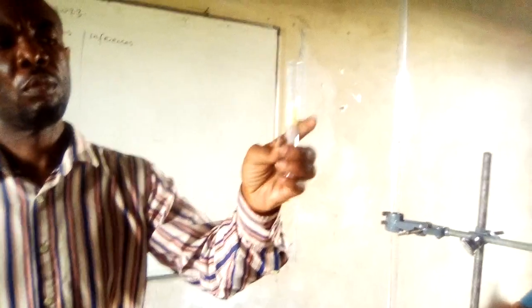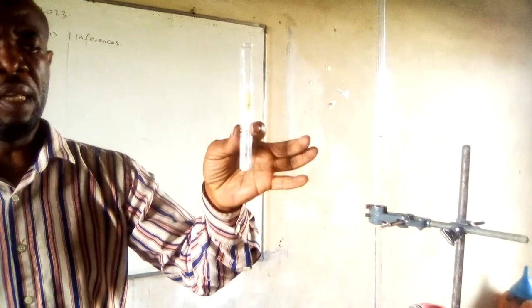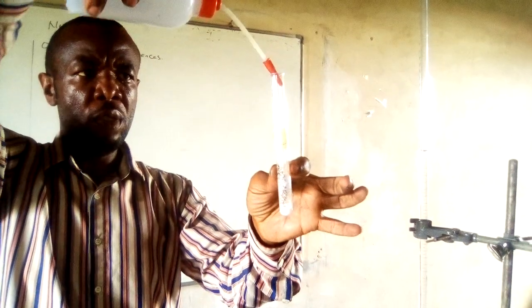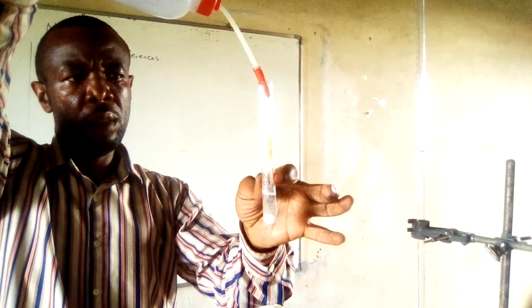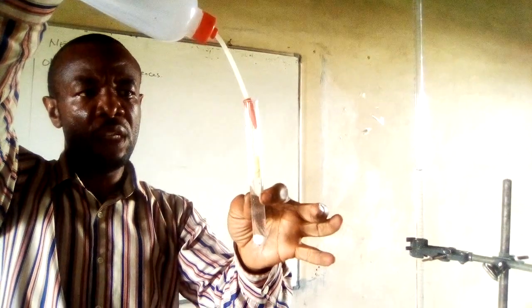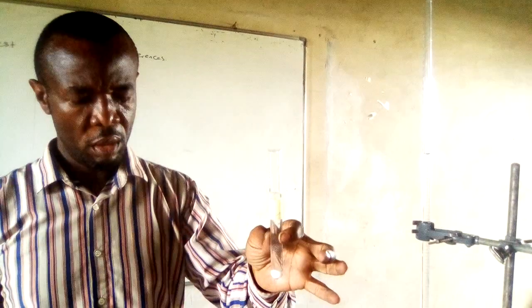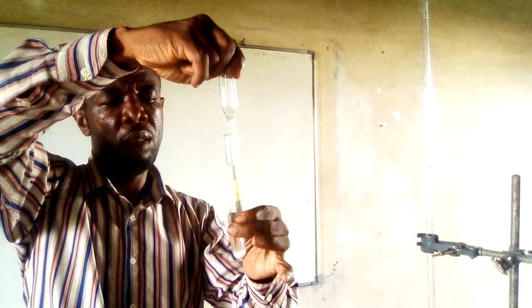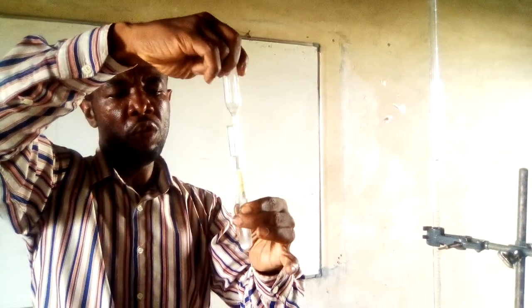So what I'm holding is sample C. We are adding water to sample C. 5 cm³ we estimate to be perhaps half of the test tube. And then stir. By stirring, we are testing the solubility of C in water.